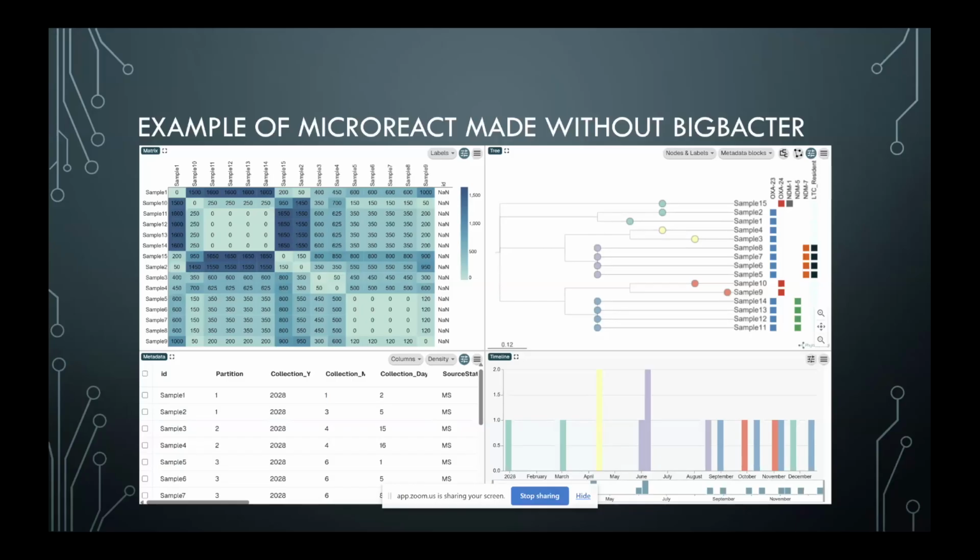or samples 11 through 14 very related, different NDM gene, not in a long-term care facility. And so I think this type of information can enable epidemiologists to choose where to put their attention first, if they need to, and how to coordinate a response. And I think that's what makes this tool so useful.